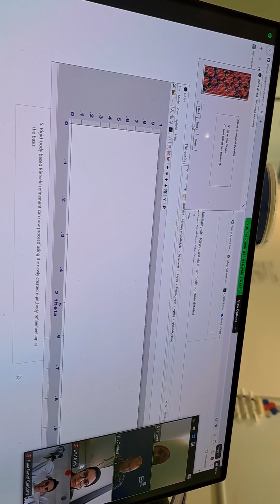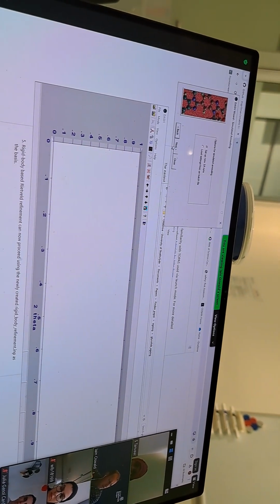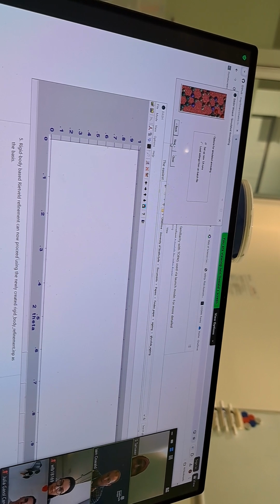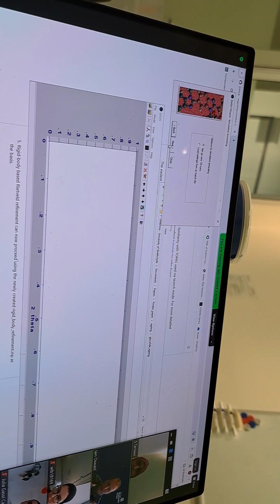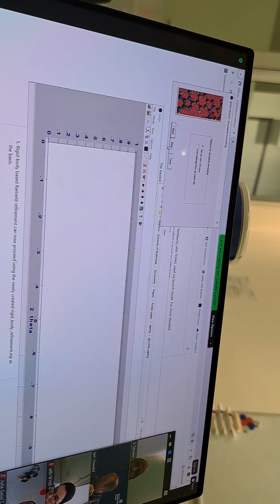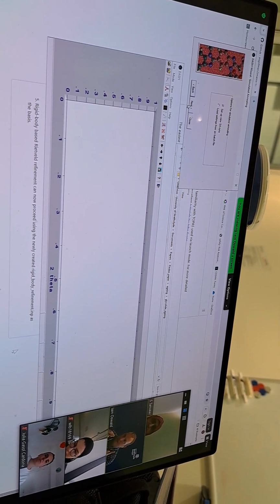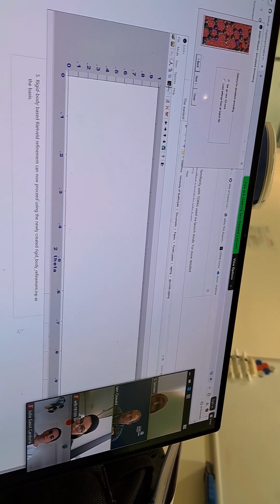So just as a reminder, we've got our CIF file that is a coordinate-based system based on your unit cell axes, so fractional coordinates of a unit cell. So you are a fraction of the basis vector. Remember, your basis vectors are A, B, and C, your unit cell. They're called your basis vectors because there's a direction and a magnitude associated with them. And then each of our coordinates for our system is a fraction of A, fraction of B, and fraction of C.